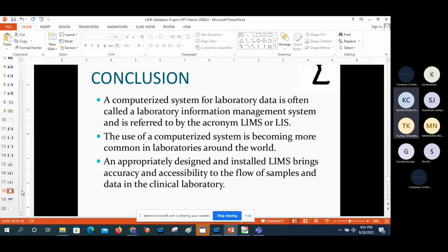It would be sufficient for cracking interviews nowadays, because master data creation is very important there. Once you implement the LIMS, there should be continuous support until the entire master data is created in the system. Even once you are done, for example, there are 10 people in the organization.